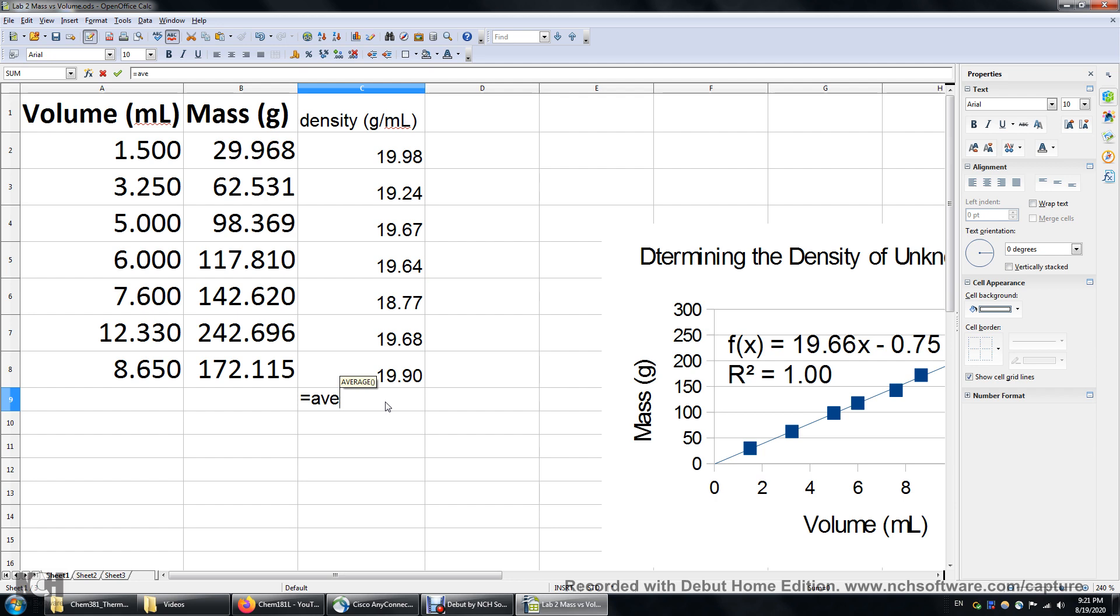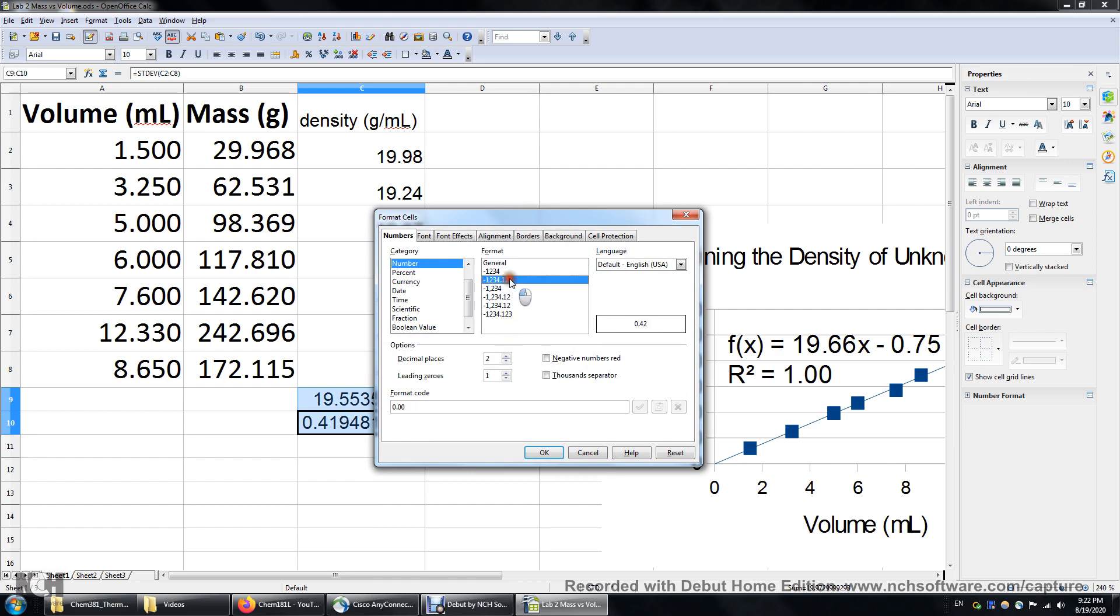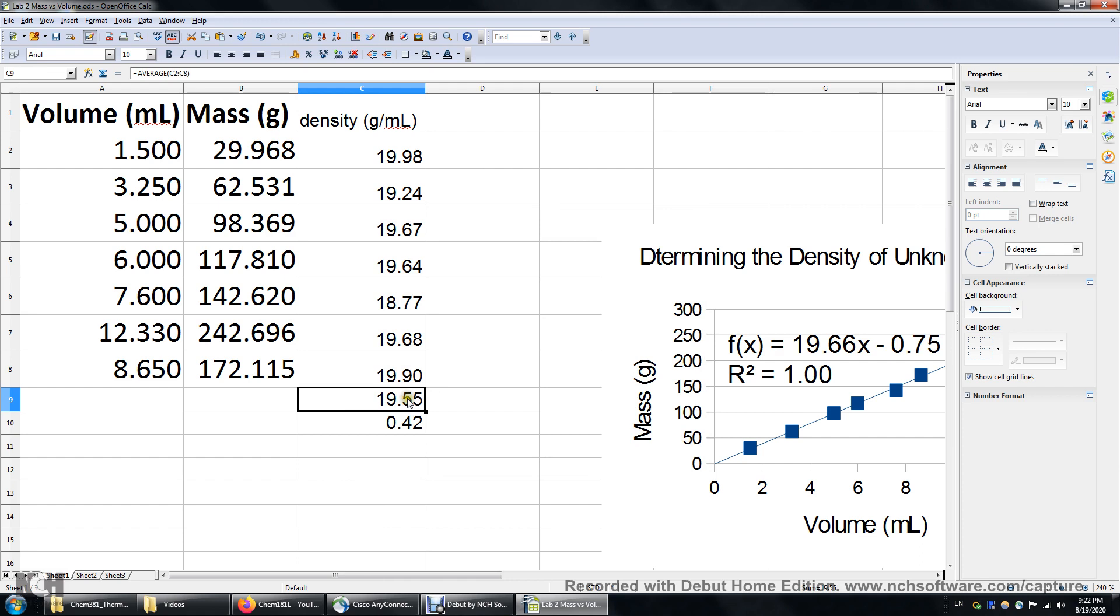Now I will get the average of the seven values. The equation is average. So type equal sign and then average and then select all the data. So this is average. And now I'm going to get the standard deviation: equals STDEV, standard deviation. Again, I'm going to select all the data here. So now I will format these two numbers. Format cells, number, two sig figures. So this number is the average. I'm going to label this. And this number is standard deviation.